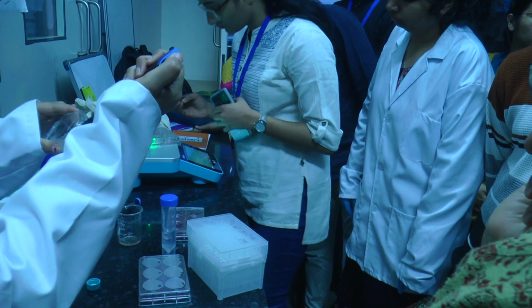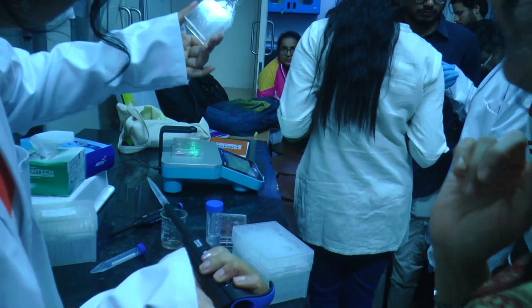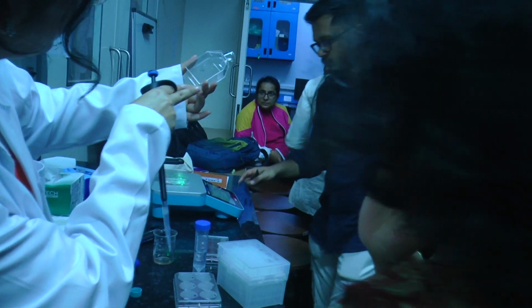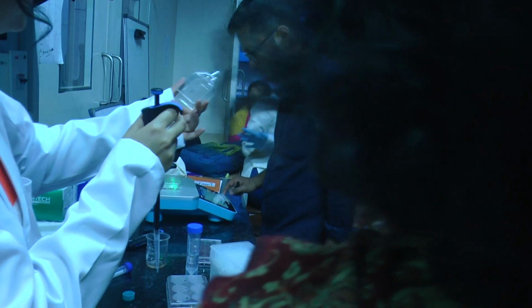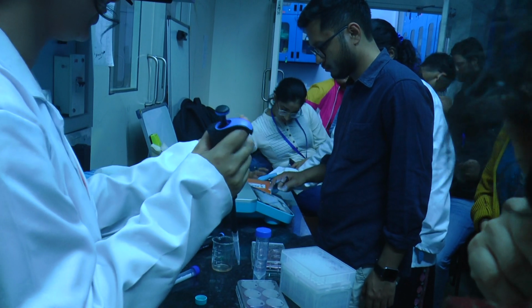And your cell pellets are at the bottom? Yeah, they are at the bottom. Even if we see with the light, they will be visible as a turbid, white layer. It is difficult to see, but it is visible.